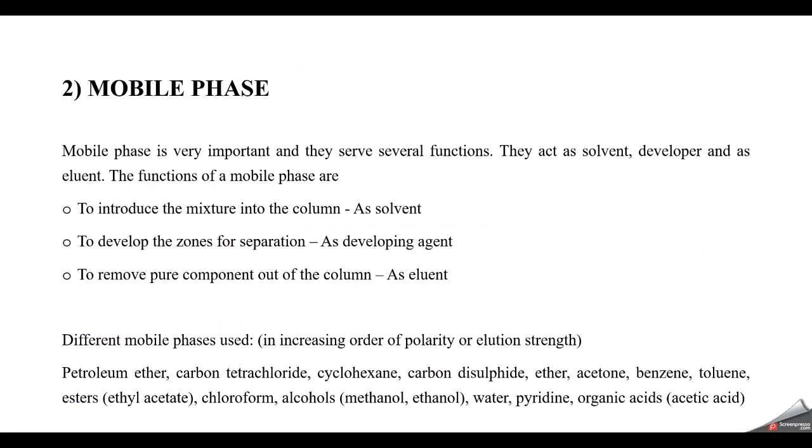The mobile phase. The mobile phase is very important and serves several functions. It acts as solvent, developer and as an eluent. The functions of a mobile phase are to introduce the mixture into the column, act as solvent; to develop the zones for separation, act as developing agent; to remove pure component from the column, act as eluent.